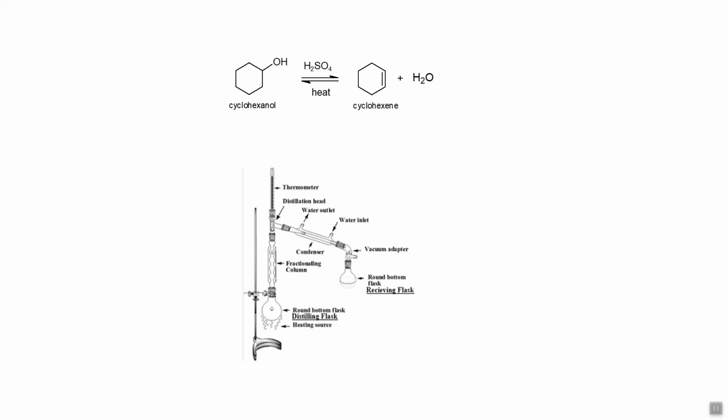You can burn this, so the reaction mixture will turn black. If that happens, you can continue to do the reaction, and you can isolate some product. This happened during testing, and it wasn't a huge problem. However, it does make it a pain to clean up, and it's not good technique. So let's keep the heat low, and let's get a good reaction going.